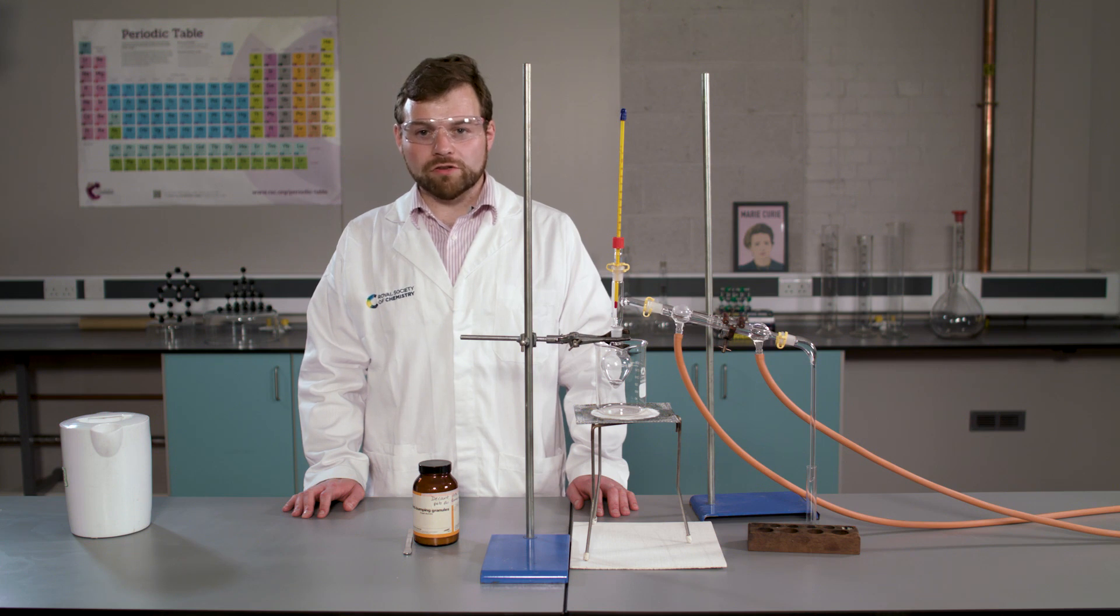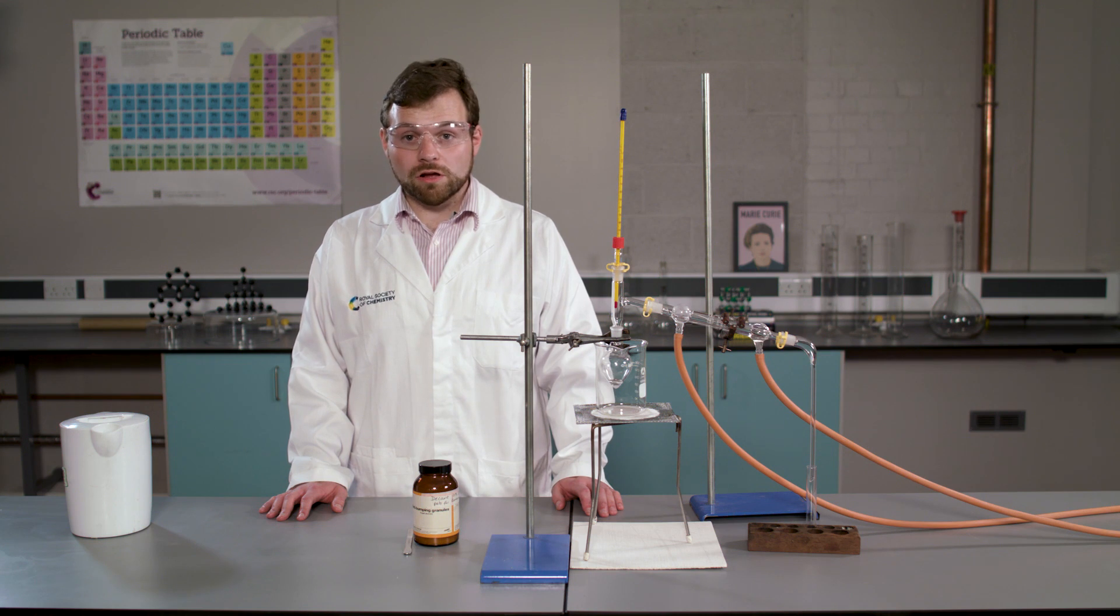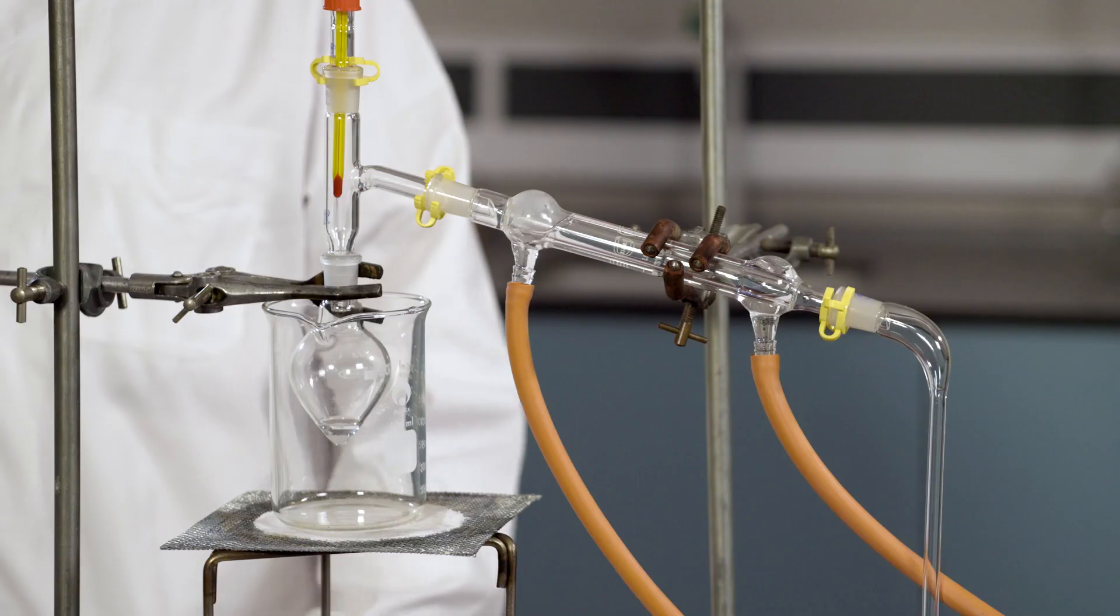The product in the correct temperature range is collected in a clean, dry test tube. Note, we must not allow the flask to boil dry. Now we are ready to start our distillation. Don't forget, our water inlet is at the bottom of the condenser.